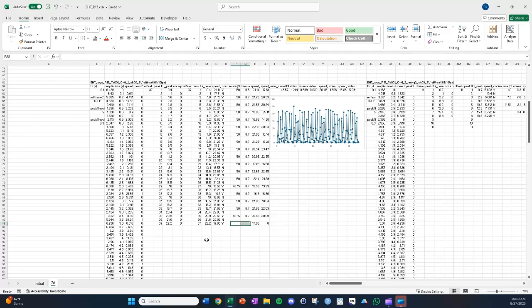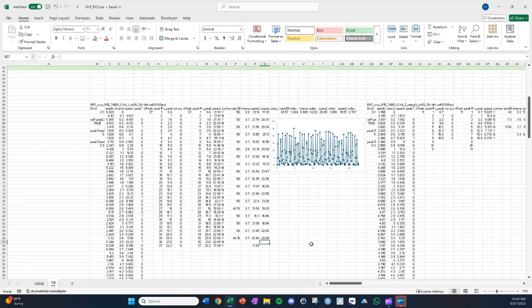Sometimes one thing to notice here is that sometimes there's going to be an odd number of peaks, in which case I'll go back just to show what I did. The interval, whenever it's calculating something that isn't there, you should basically delete it. That's the rule. So just check at the bottom of this list. It most commonly happens in the beats per minute column, but it can also happen in the other columns. So just check that you're doing that correctly.